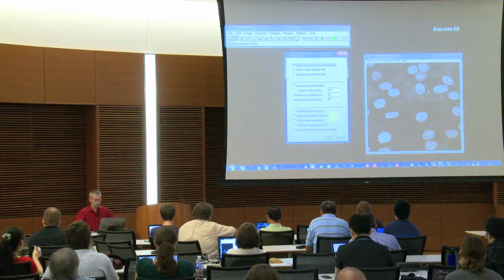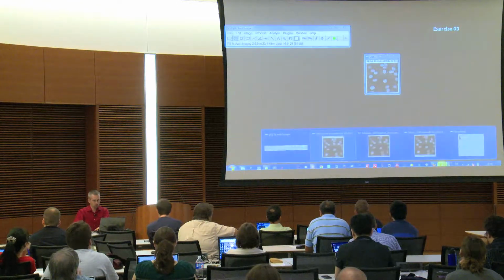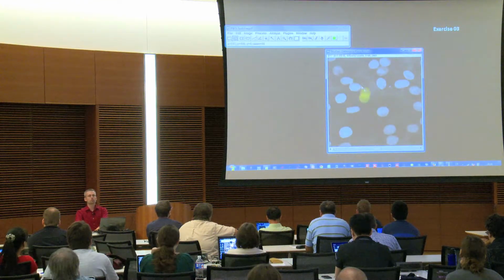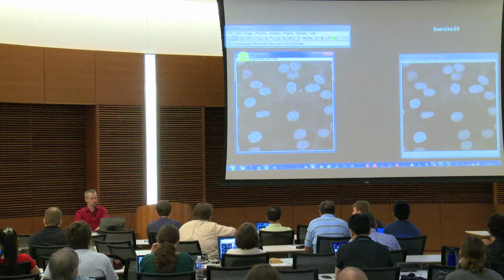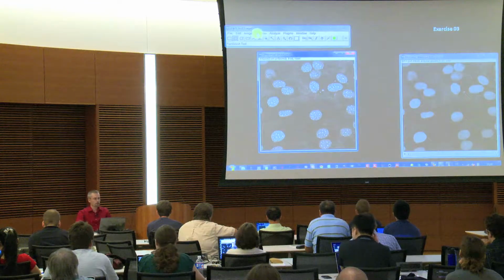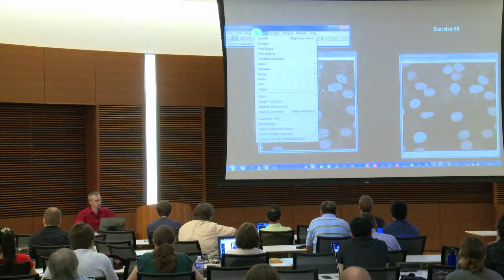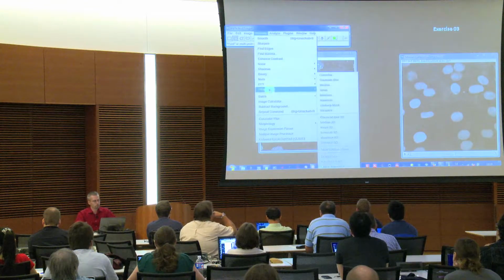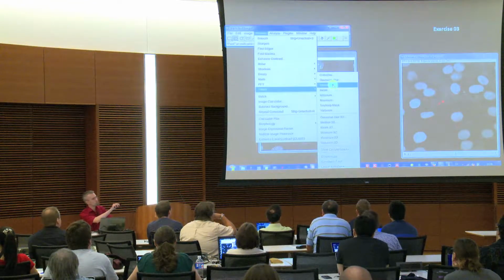Honestly, I'm incorrect. Sorry for that. We obviously need this one. So do you still have that open? If not, then take the original. Go to Process, Exercise 3, the image. Go to Process, Filters, Median. That was what we did here.